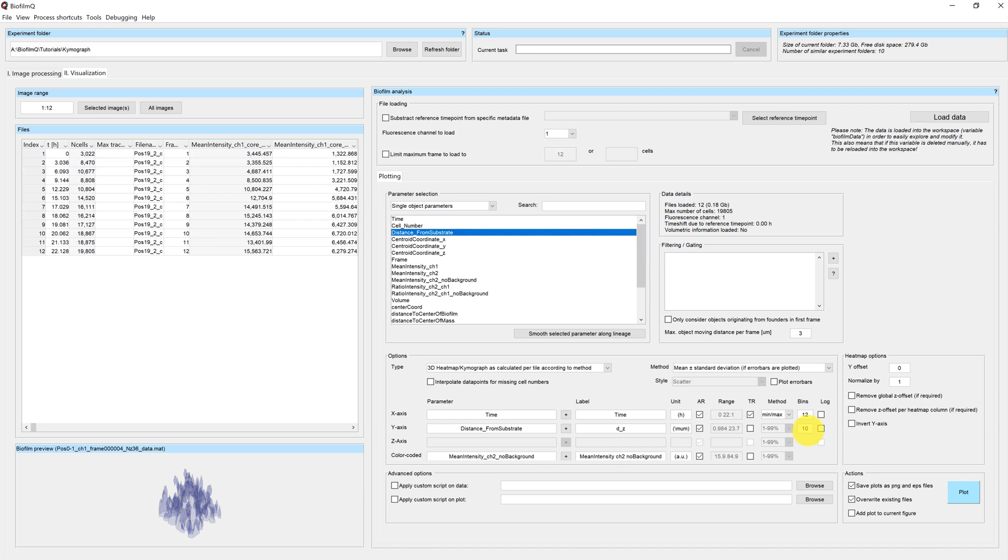So if we want to have a bin size larger than our cube size, we can choose for example 15 here.